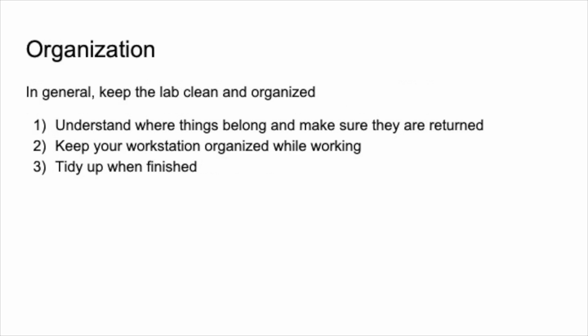Quickly, organization in general is hugely important. You want to keep the lab as clean and organized as possible. So you want to make sure that you understand where things belong, since most things do have a dedicated home where they live. So if you take anything, you return it where it's supposed to be, and you understand how the lab is organized. In general, just as a best practice for everything, you want to keep your workspace as organized as possible while working. Don't let it get too cluttered, and clean it up when you're finished.